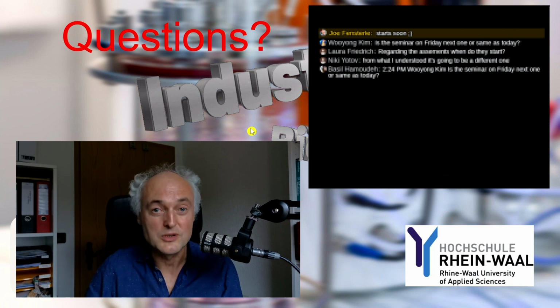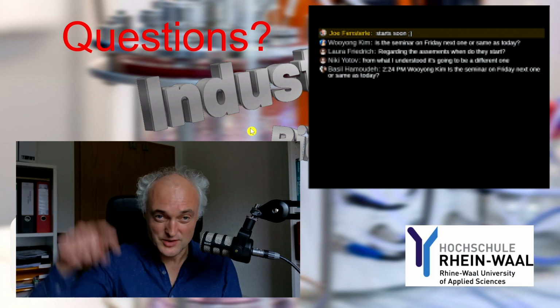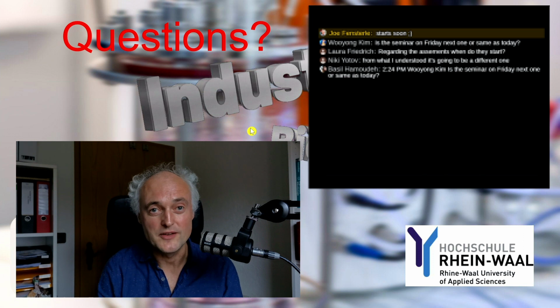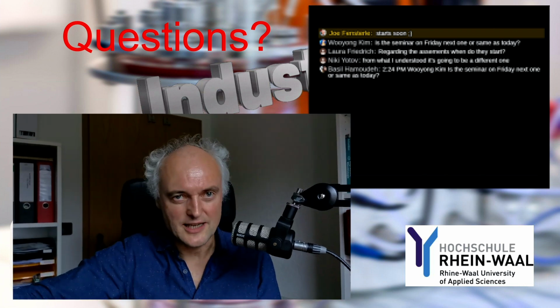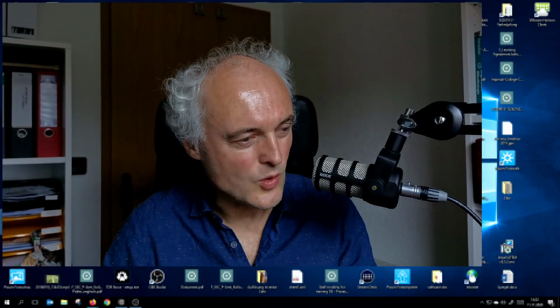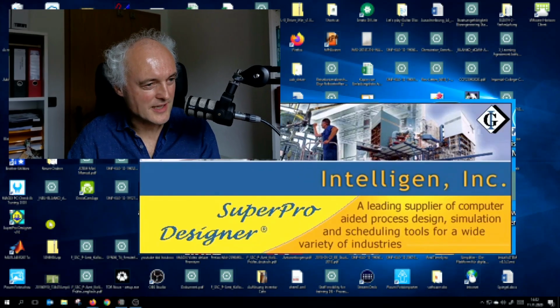Assessment, when do they start? I will tell you. The assessments are of course not for the seminar, they are for the lecture part. I think if they start, they will start after the next lecture. But I will, of course, tell you within the lecture when we will start with the assessments. Don't worry. Okay, so I start now the SuperPro Designer.